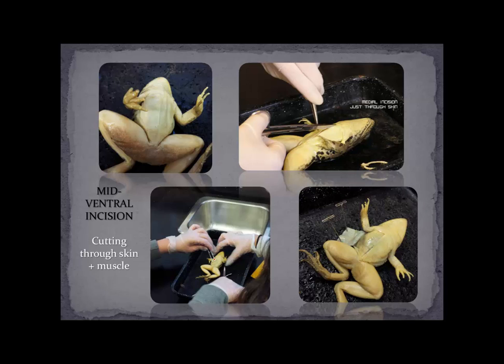Here you can see we're making a medial incision just through the skin, inserting the sharp end of these very fine scissors down in the pelvic region and cutting upwards, making shallow cuts just below the skin. The student is using forceps to grab the skin so that the incision can be made. In this image, the skin has been partially cut up, then down under the arm and over the leg at the hip region, and the skin has been pinned down. They're going to repeat the same thing on the other side.